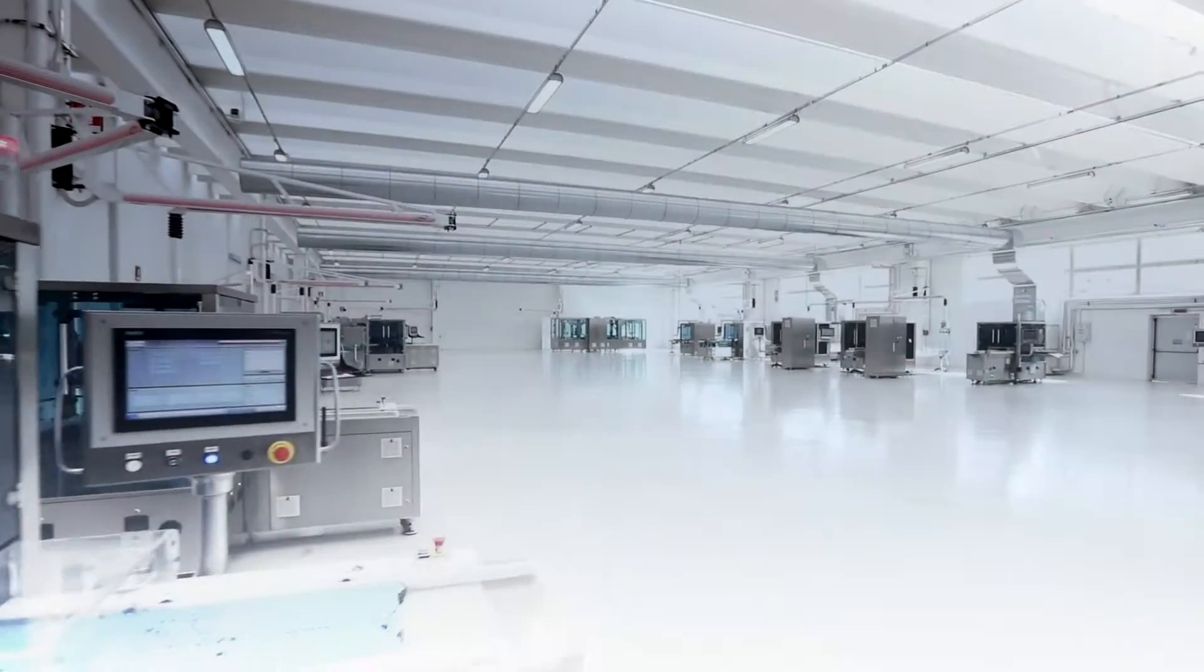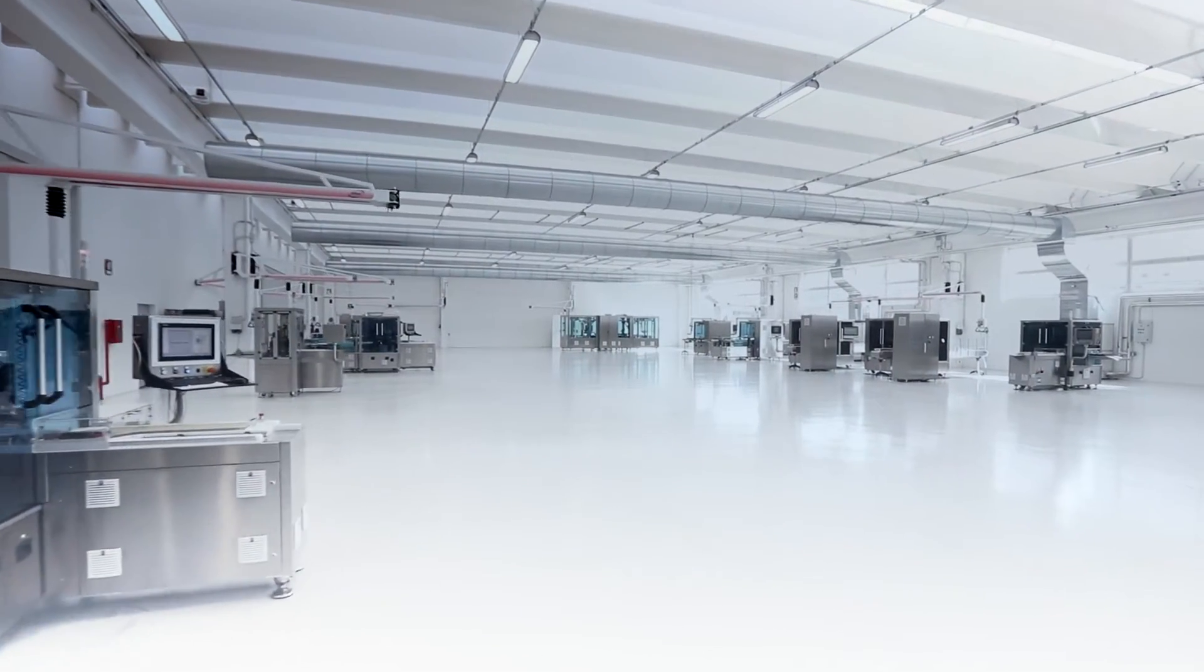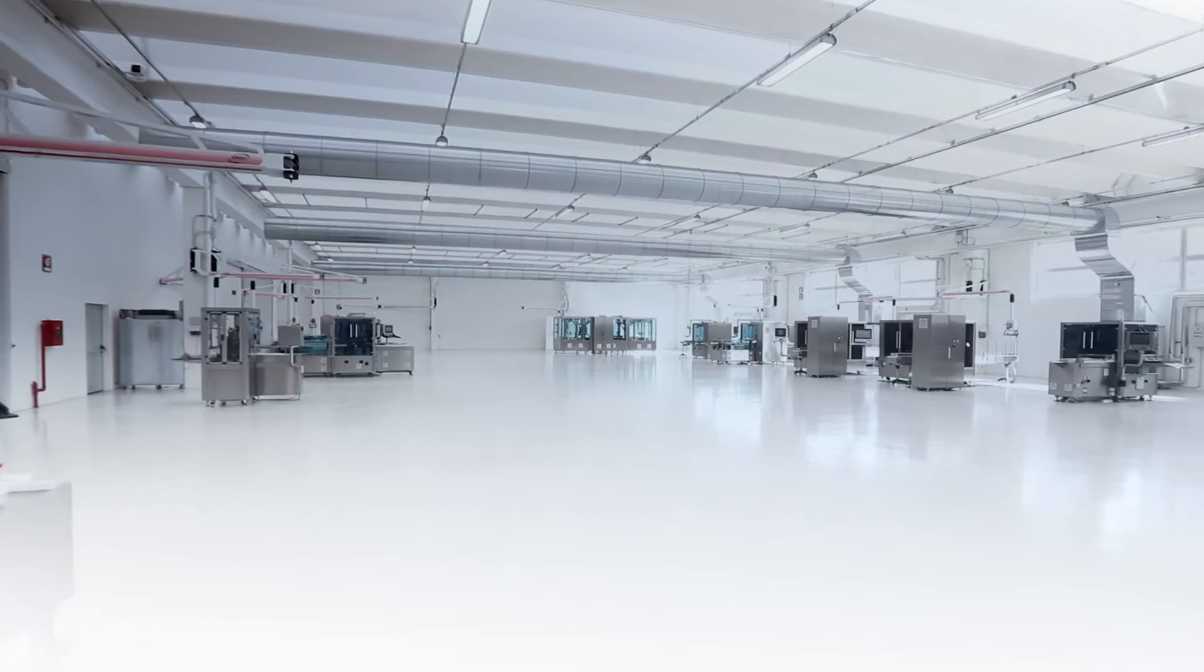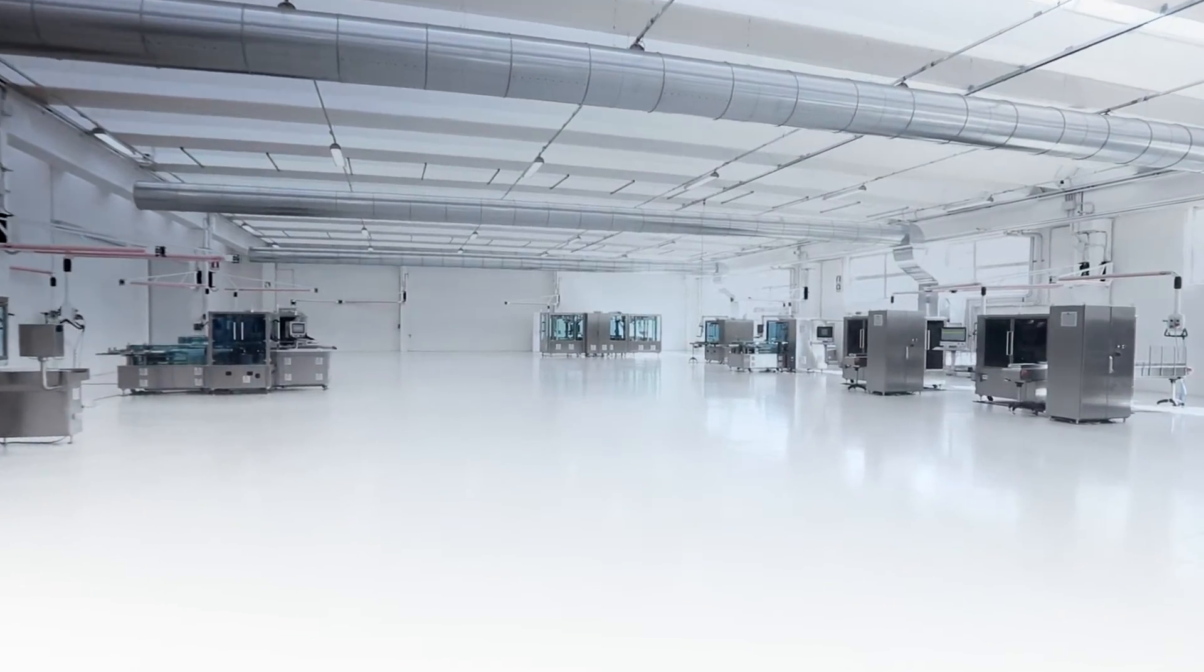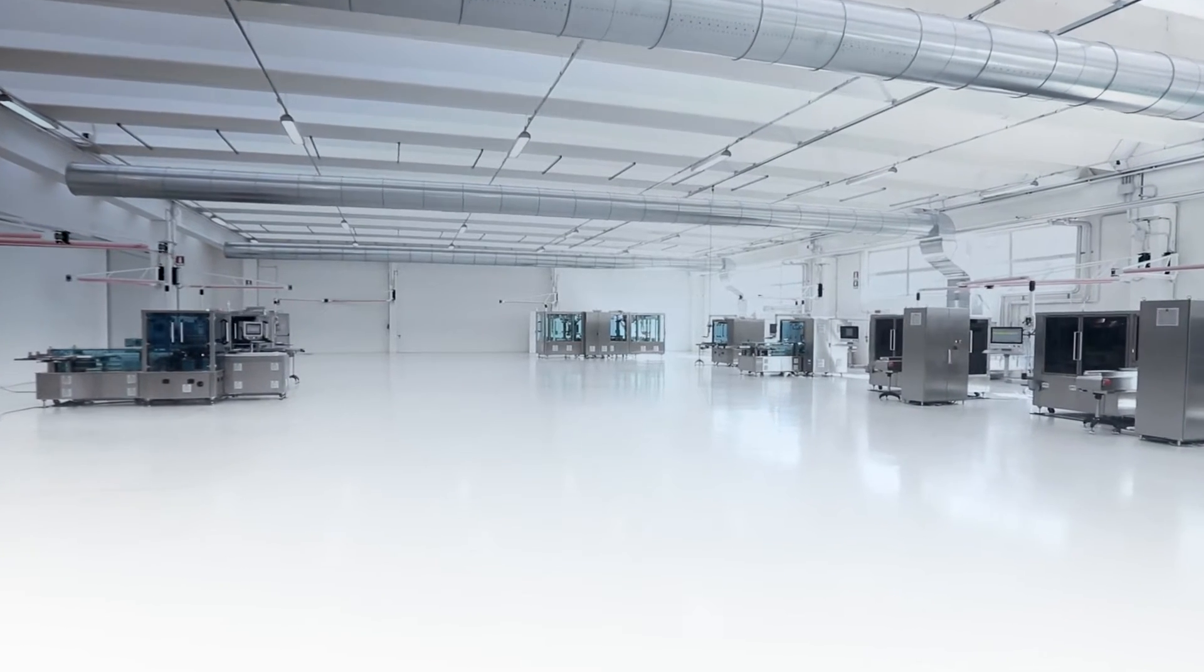The continued growth of the inspection machines market is primarily tied to the increasing number of regulatory mandates in the healthcare industry to maintain compliance with good manufacturing practices.